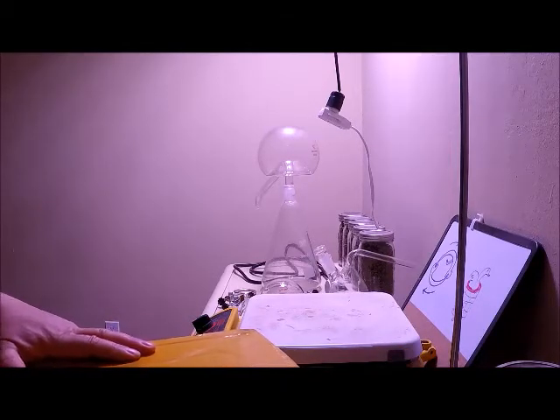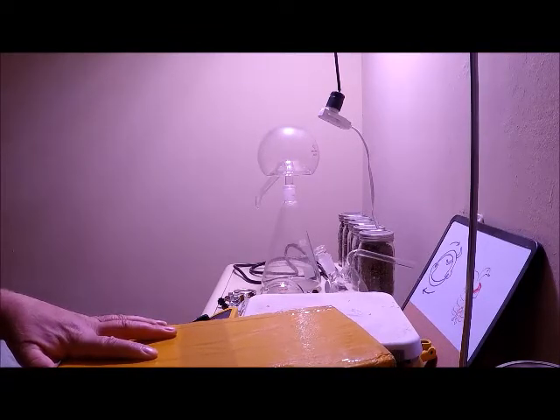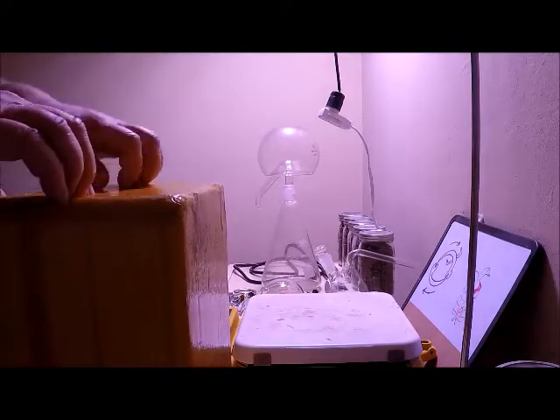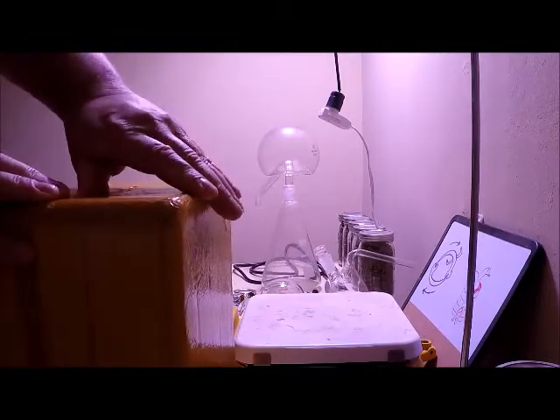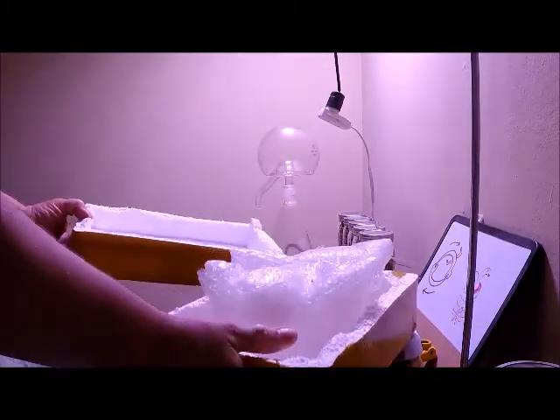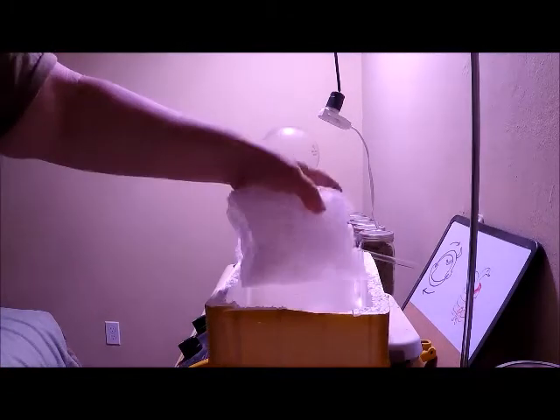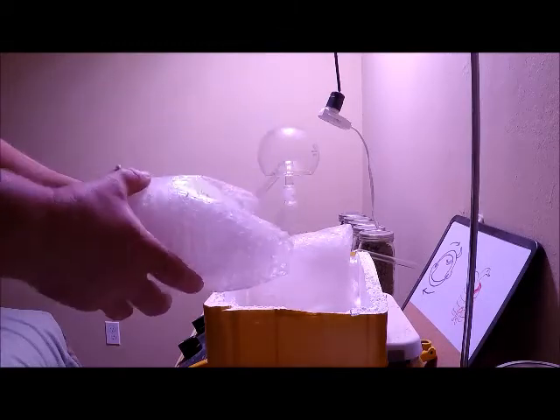I'm going to open it up, check out the contents. See how hard it is to open. It's packaged pretty well. Let's see. So there's two things in here.